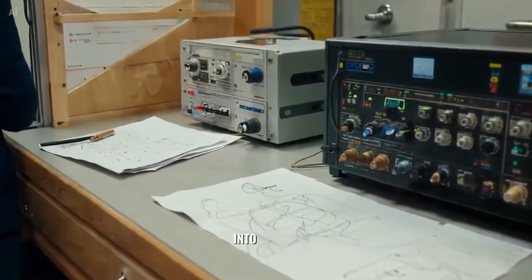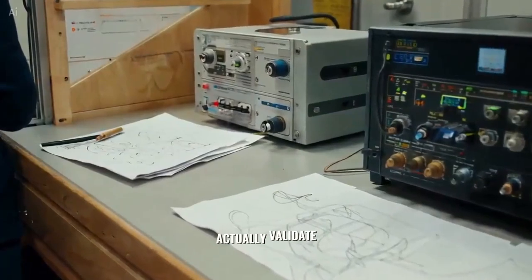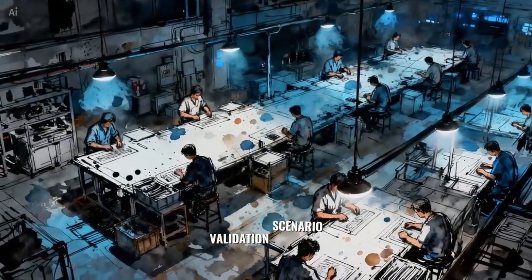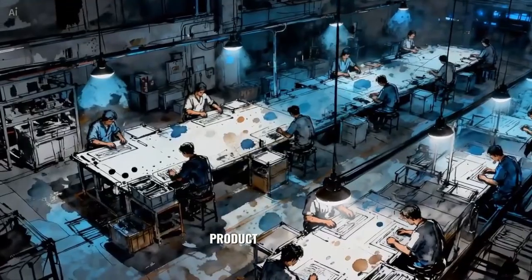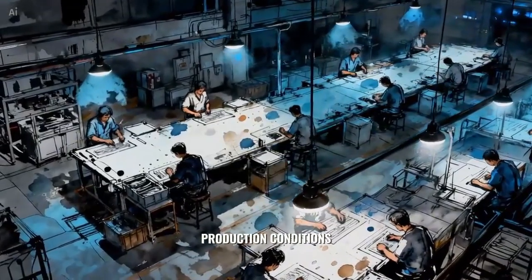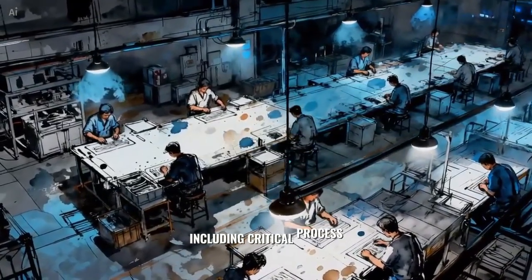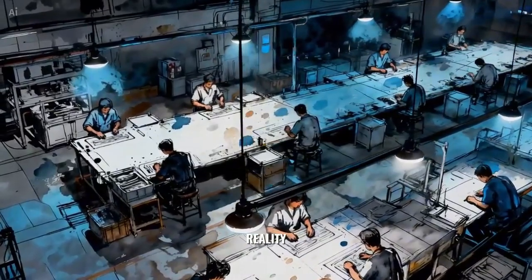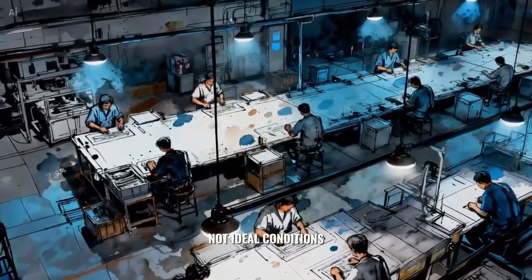Now let's get into how to actually validate. First, define the validation scenario using a representative product under real production conditions, including critical process points. Validation must reflect reality, not ideal conditions.